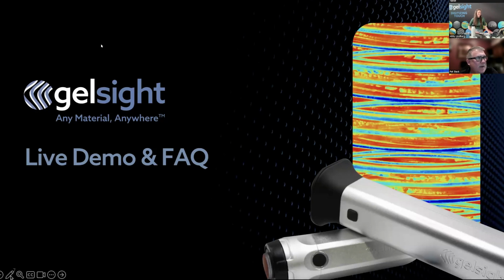Does this quick RA measurement let us deal with complex surface corrections not flat or predictable curves like the polynomial corrections mentioned earlier? Or would we need to deal with that through a less quick pipeline? I would say yes, because like I said, the roughness filter itself basically will remove those long wavelengths.